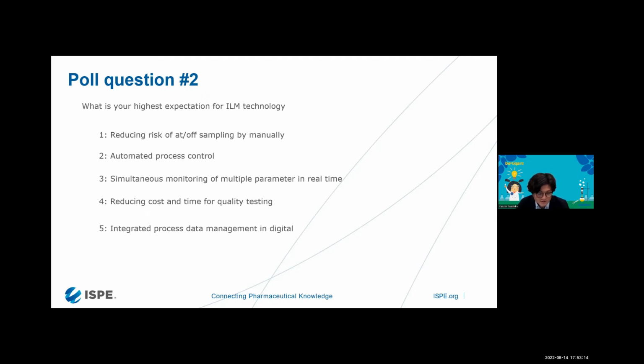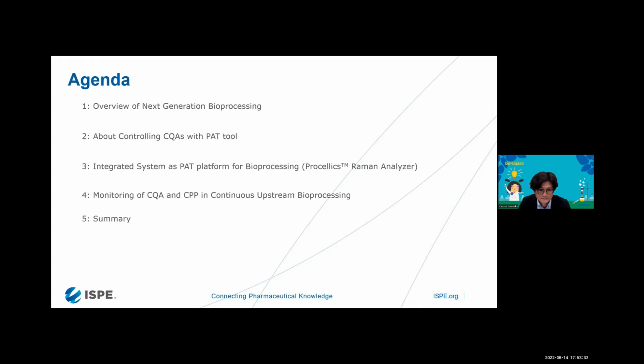Thanks for your answer. So very interesting result. Thank you, Jeffrey. I'd like to move to the next slide. So, as the next topic, I'd like to talk about the integrated system as a PAT platform for bioprocessing.